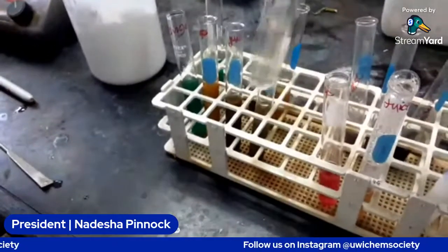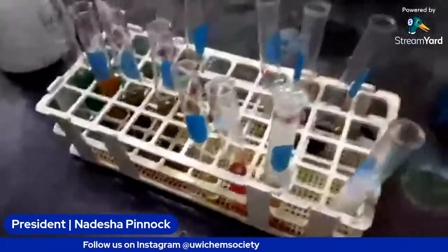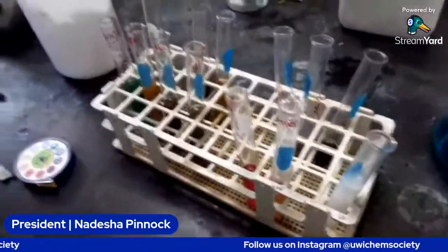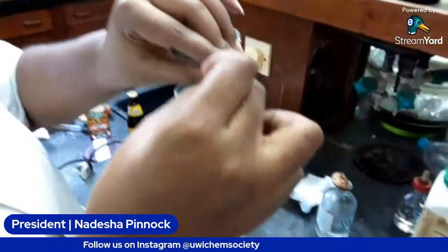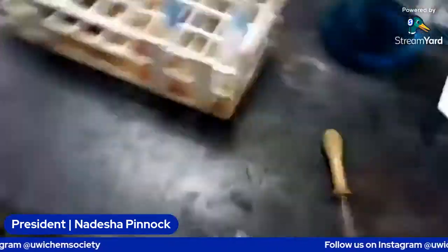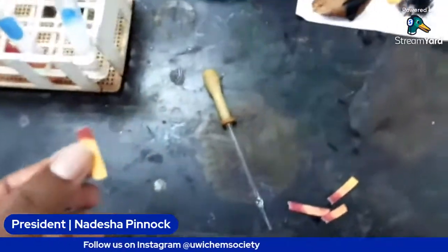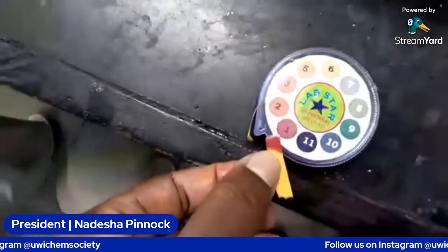Alright, we'll test them again. This one's still a bubble. I don't know what's in there. Probably the other stuff in the fruit juice. Likely. So we're going to test the pH of this, the sucrose solution. It is still acidic. It still looks like one, honestly.